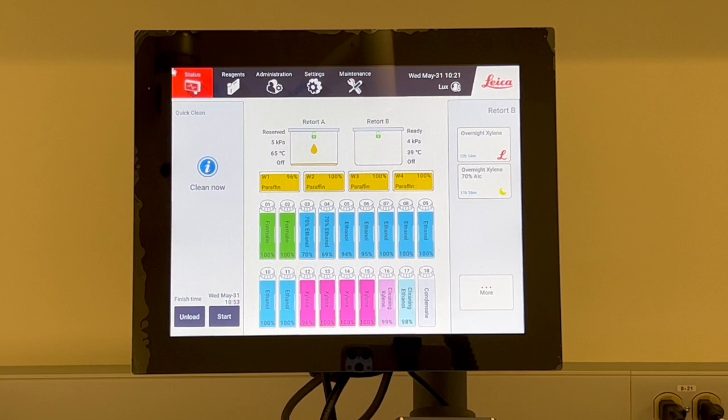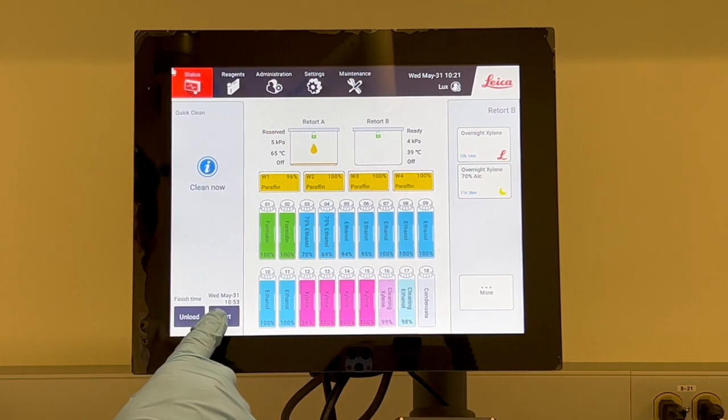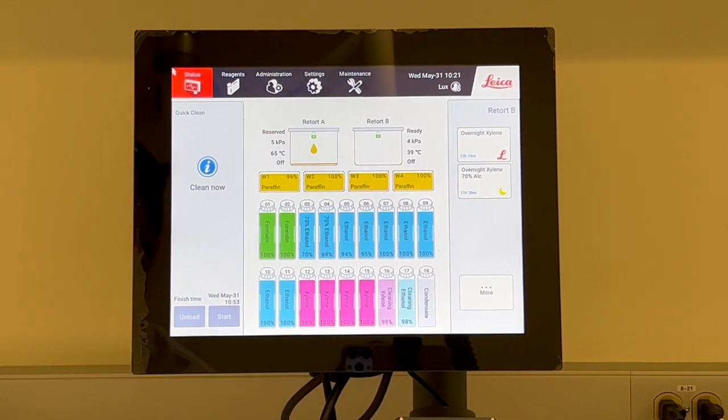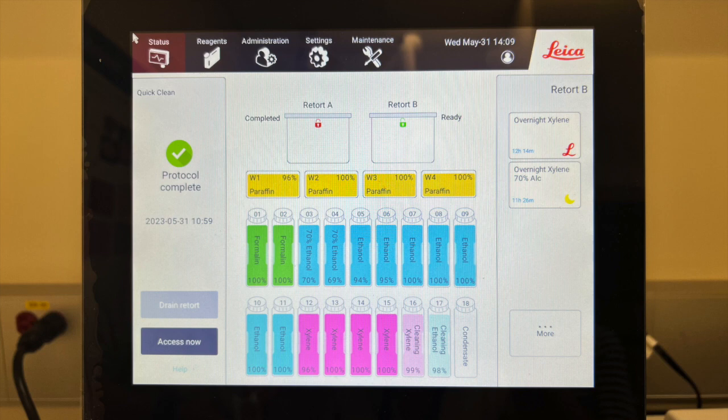Now, you will see the clean now panel. Please ensure you run a cleaning protocol before running the next processing protocol. Accept the pre-selected default protocol for cleaning. You will be prompted to place your dirty baskets in the retort. Please ensure that all tissues have been removed from the baskets before you do so. When the cleaning protocol is finished, the protocol complete panel will appear and an alarm will sound.